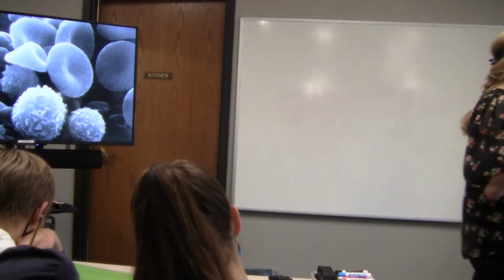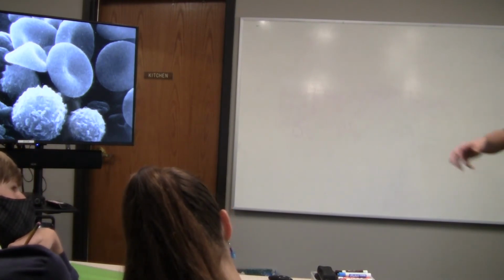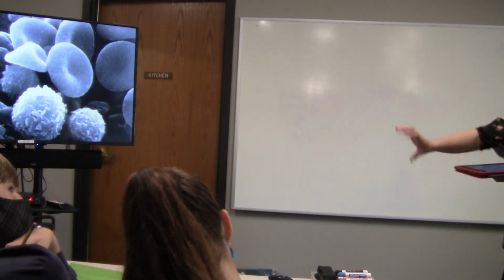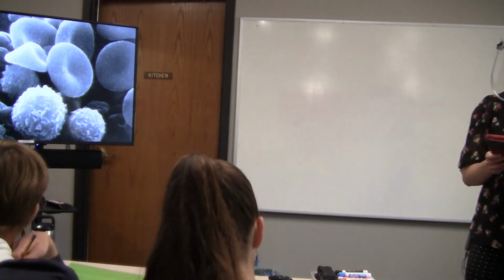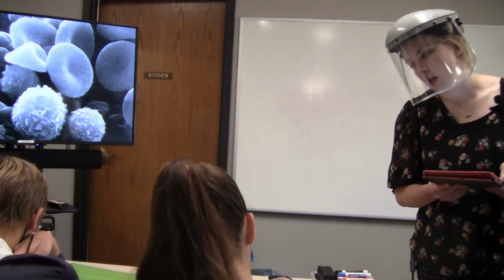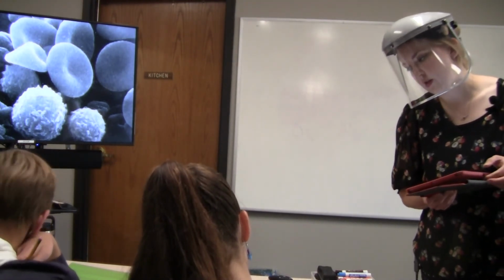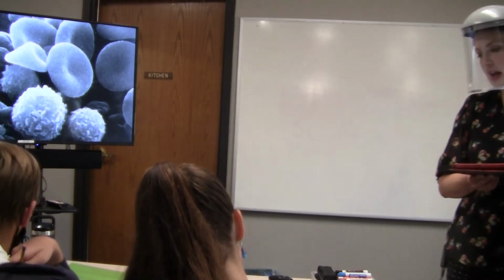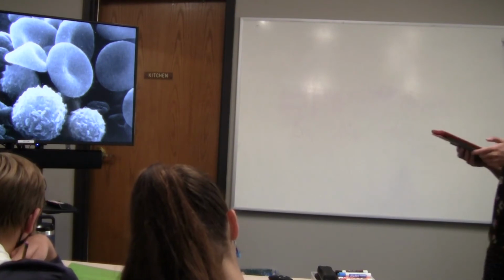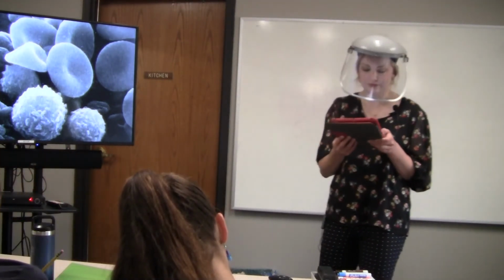All of ours have a light on them, but some microscopes have a mirror, where you have an external light source, like a flashlight, and you catch the light with the mirror and focus it. Connects the eyepiece to the objective lens. That is the tube.